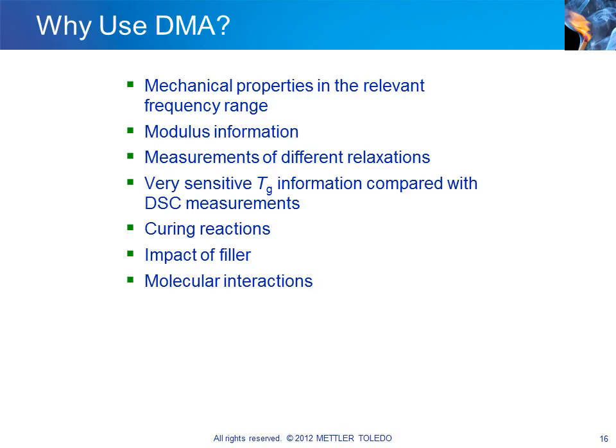The investigation of relaxation behavior is also very important. In particular, relaxation in the main relaxation region, that is, in the glass transition region, or in secondary relaxation regions. The latter relaxation has to do with the mobility of short segments in polymers. No other technique of classical thermal analysis can provide such sensitive information about the glass transition as DMA.